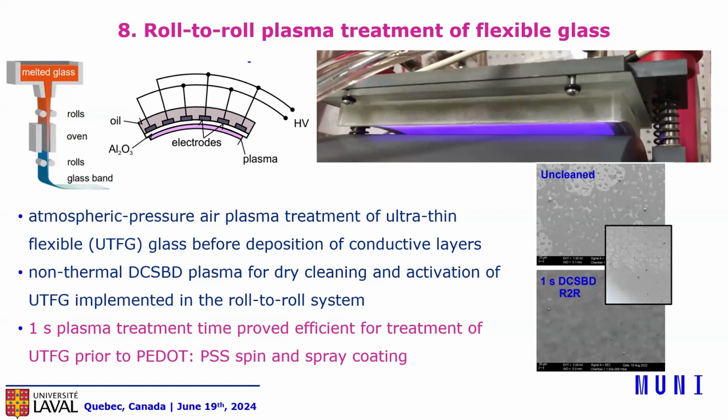Very often we do the treatment in such a way that our speed corresponds to 1 second of treatment, and if you want 5 seconds, you keep it for 5 rounds. But it is also different from treating 5 seconds slowly, because in periodical treatment your sample is in plasma, out of plasma, and then there can be some chemical process again in the plasma, and it depends on the approach. In other systems which have some movement, it is similar. We know if we have one electrode, the active dimension of plasma is 8 centimeters. If we have two, it is 16, and we can calculate.